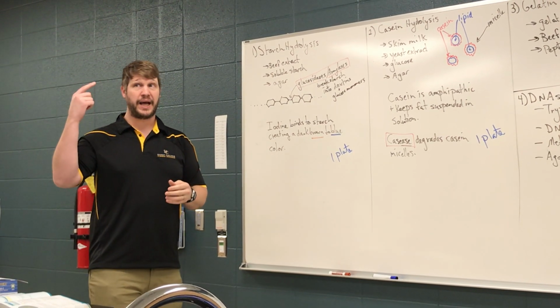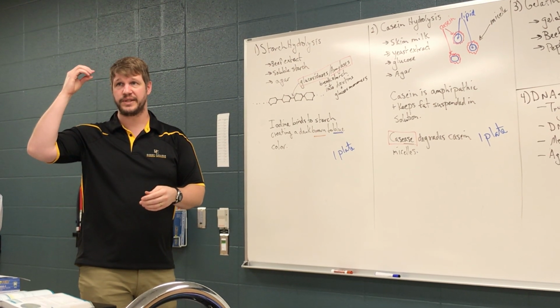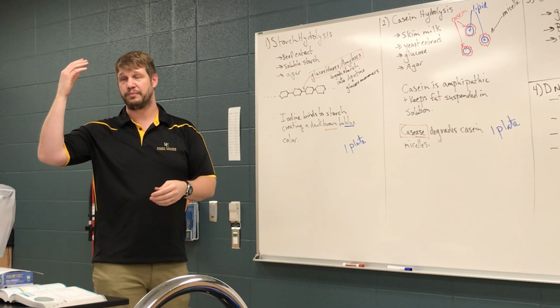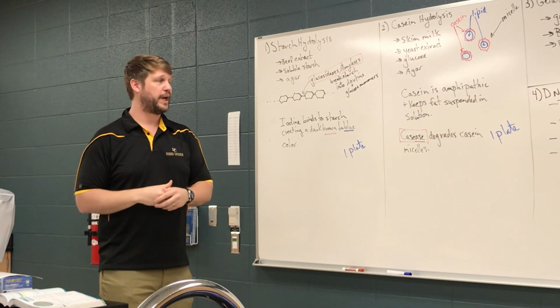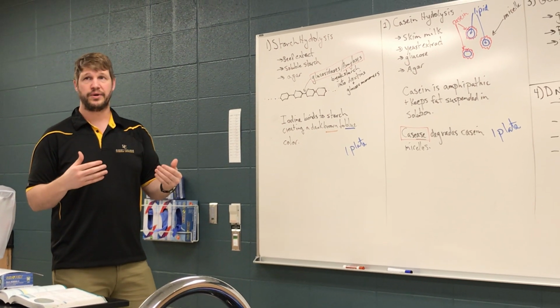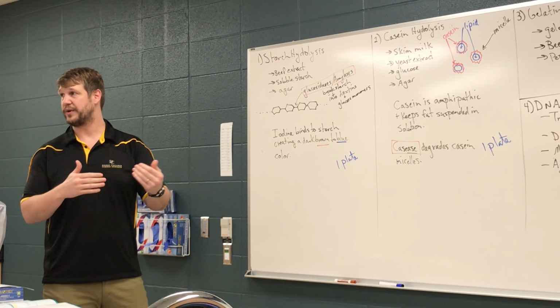So if you took botany, you'll remember amyloplasts as another name for starch grains. Right? Amyloid plaques in the brain that we see if you have certain neurodegenerative diseases, they were thought originally to be starch. Turns out they're actually protein, but they stain similarly to starch when people were doing early histological studies on those neurological disorders, so the name got transferred over.